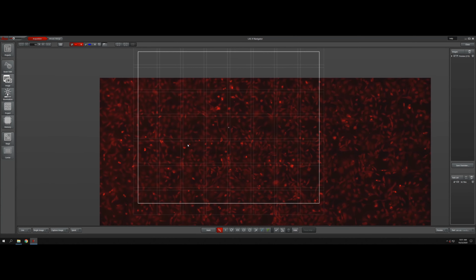One way to overcome this is to take a Z-stack in addition to tiling, but that's going to be lots of acquisition, lots of frames taken. So there is this focus map that you can create. With that you can define different Z positions for different parts of the tile that you're imaging, and it's going to acquire according to that focal map that you create.